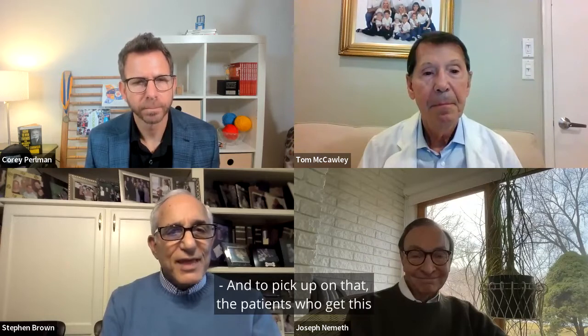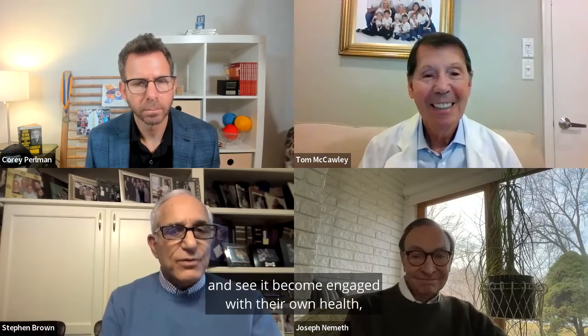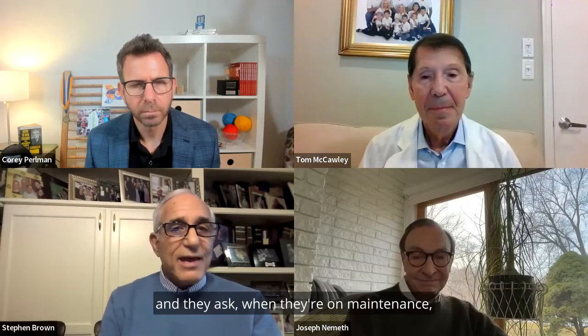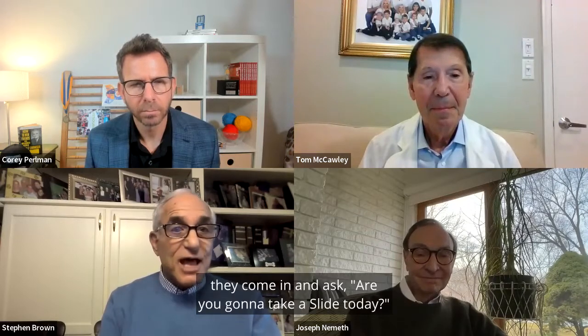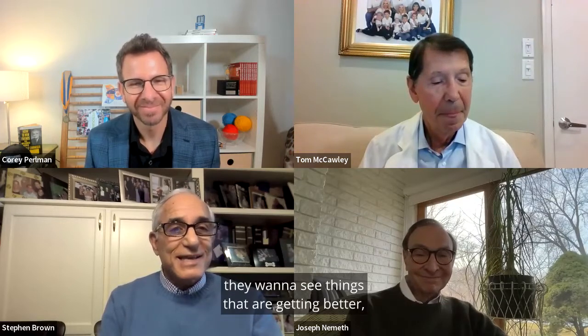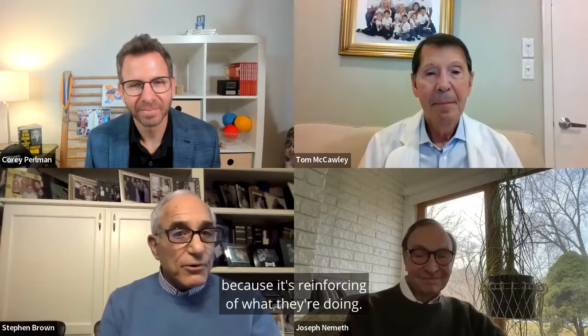And to pick up on that, the patients who get this and see it become engaged with their own health. In my case, and I'm sure in the case of both of my colleagues here, patients come in on maintenance and ask, are you going to take a slide today? Because people want to score well. They want to see things that are getting better, and they love to see the evidence of it because it's reinforcing of what they're doing.